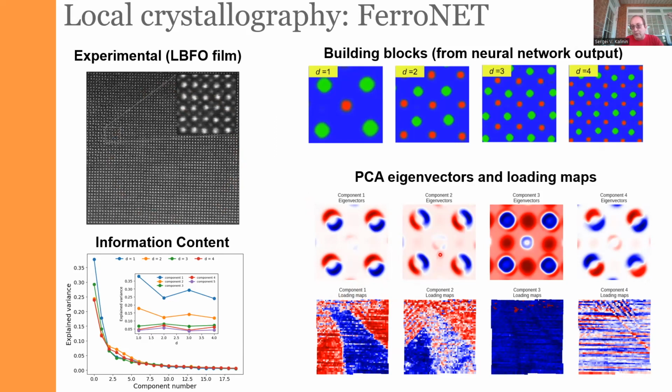Now, the second component is the displacement in the orthogonal direction. Again, see that we have a domain where this displacement is negative and a domain where this displacement is positive. You can also see that the domains in this image and this image are complementary. And that makes perfect sense because the polarization vector in this material can have 4 possible orientations in the image plane.